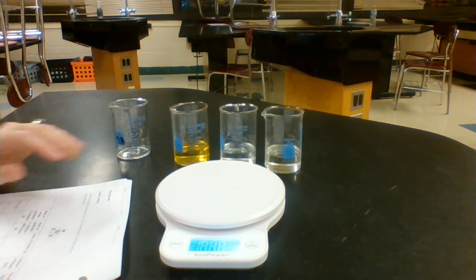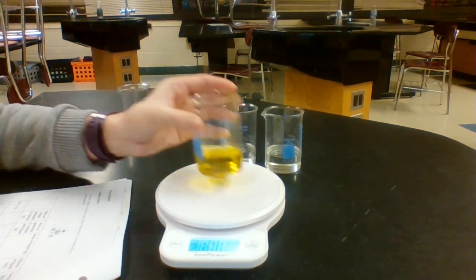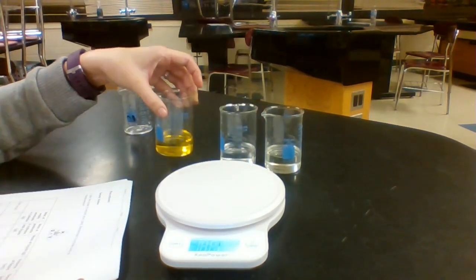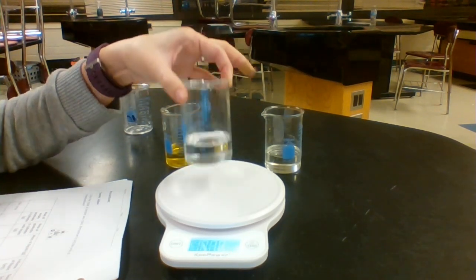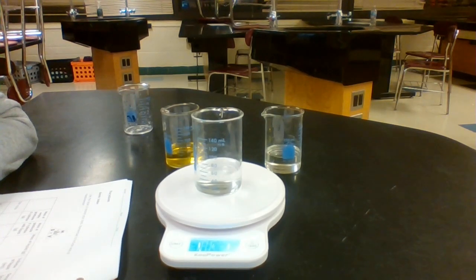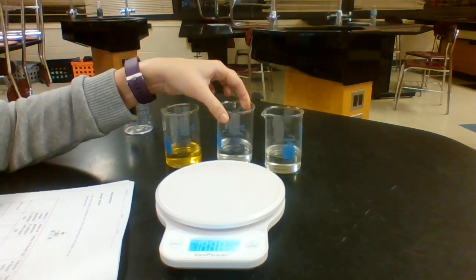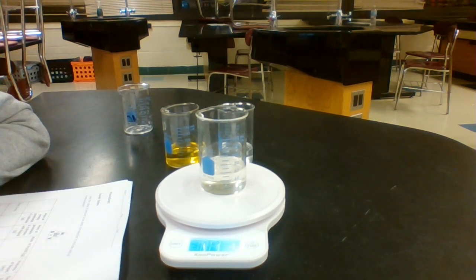What we're going to do now is find the mass of the containers with the liquids inside. So the first one, dish soap, 110 grams. My next one, the rubbing alcohol, 109 grams. Again, that's 109 grams. And then my last one, the corn syrup. That one is 138 grams.